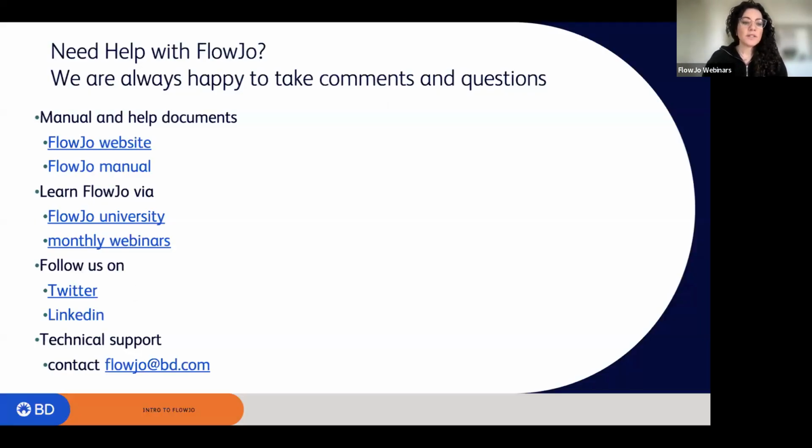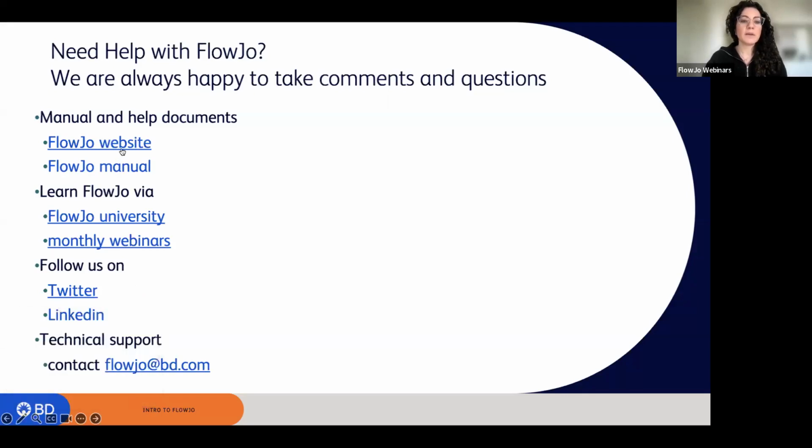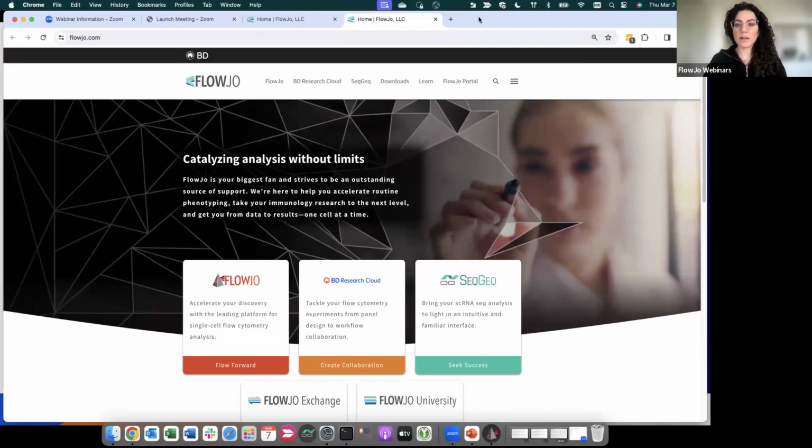Okay, so first things first, what are we going to do today, and what is FlowJo and where can you find FlowJo? You can find FlowJo on the website. If you are here on this training today, it means that you either registered through social media or through the website. The FlowJo website is divided into different areas.